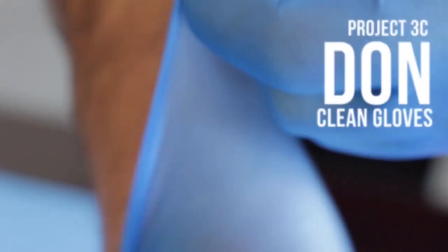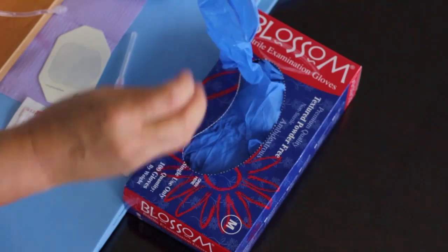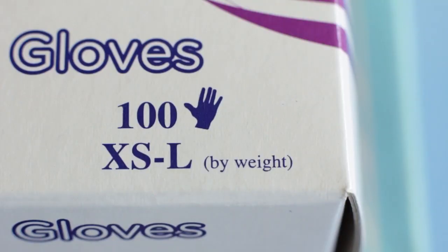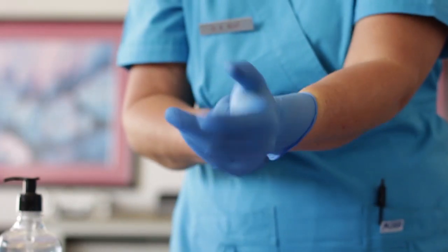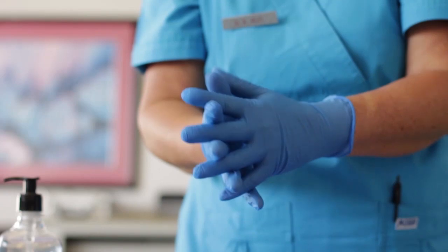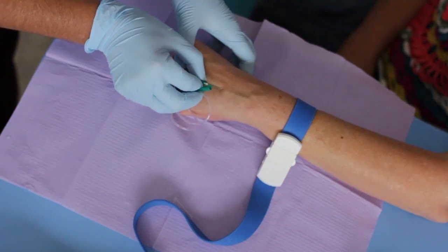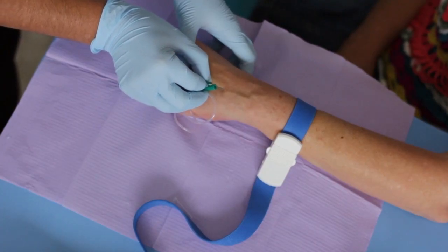Project 3C – How to Don Clean Gloves. Surgically clean gloves usually come packed in a box of 100 gloves. These are designed to fit comfortably on either the left or the right hand. They primarily serve as a barrier between the healthcare worker and the patient.